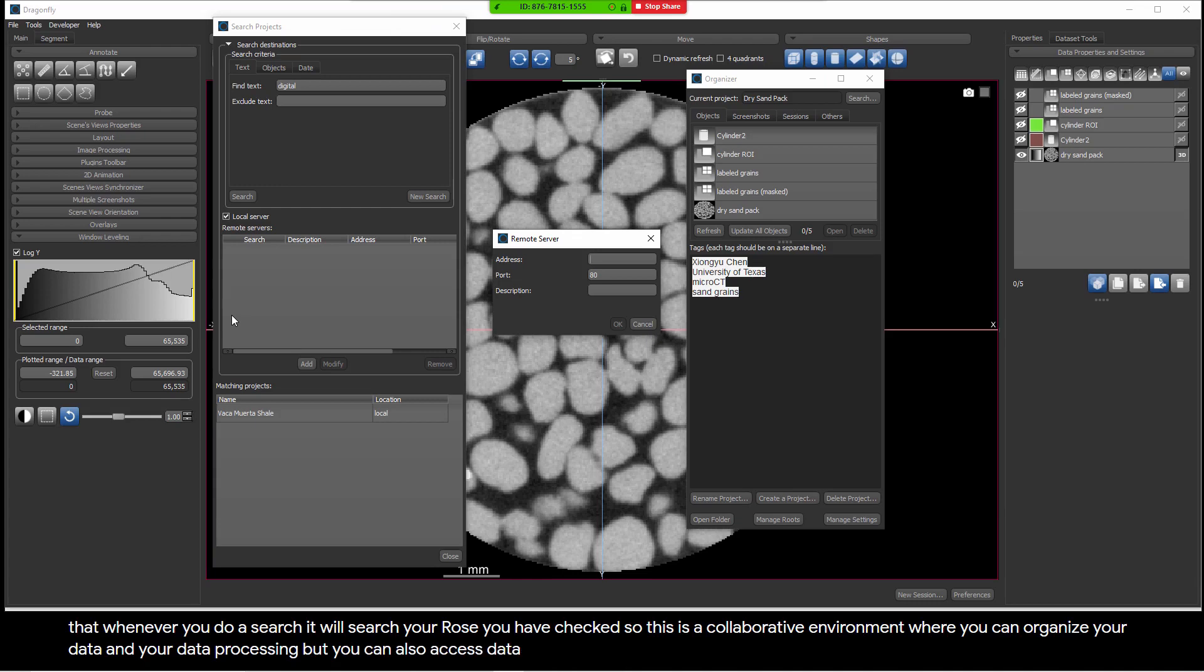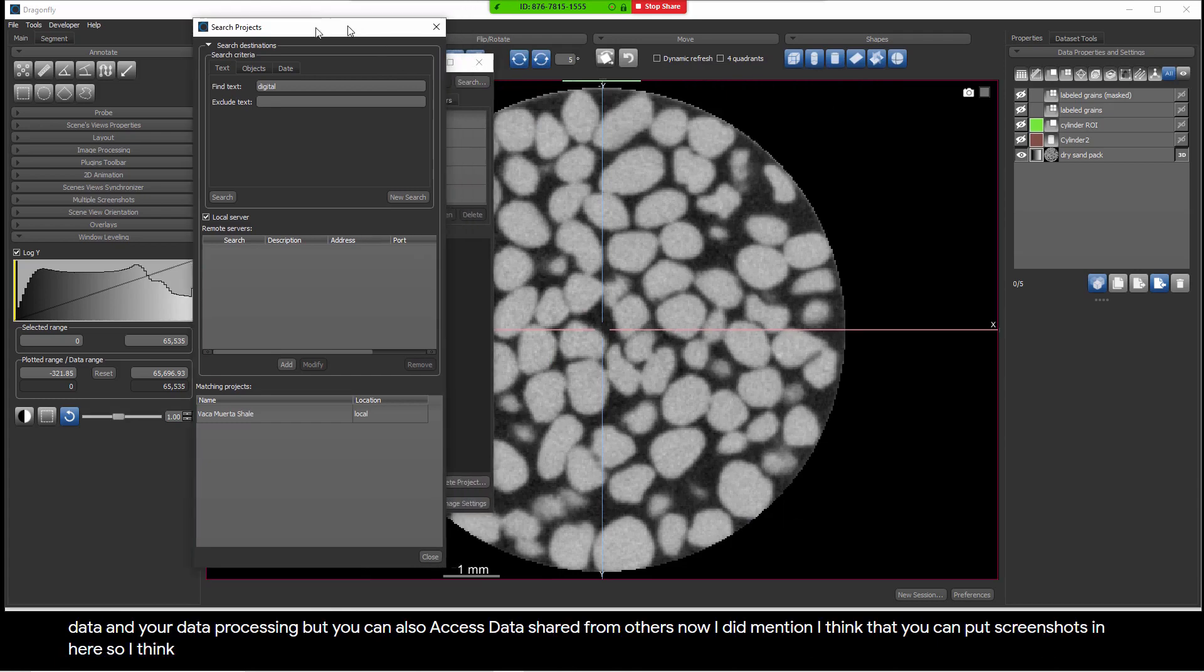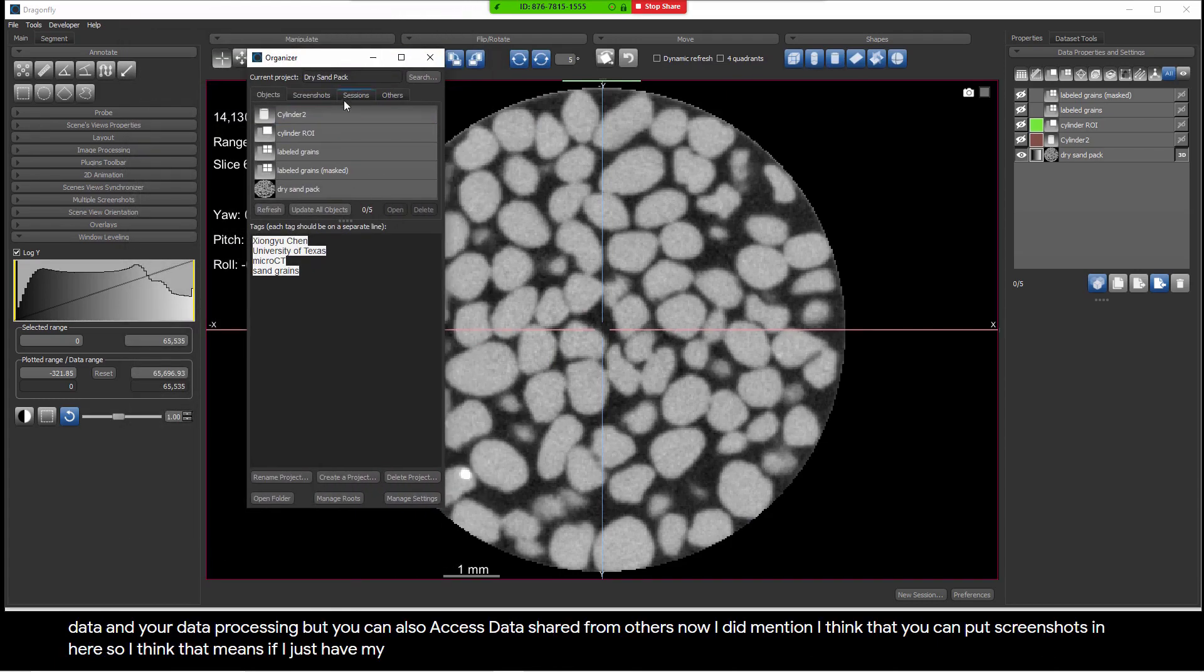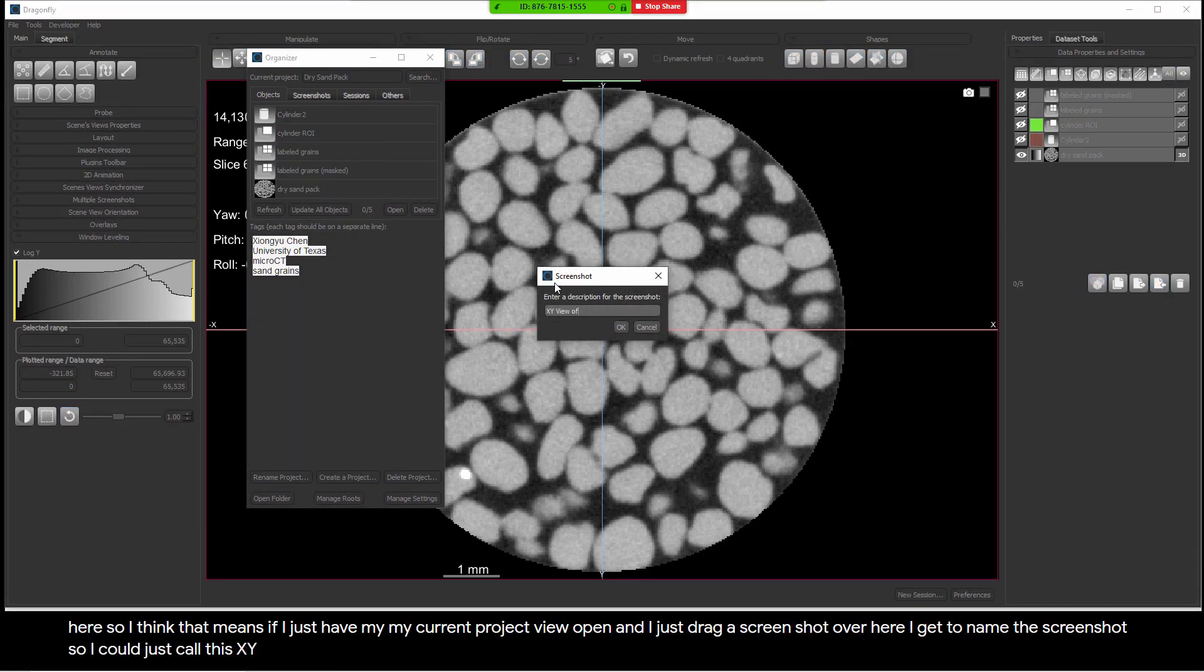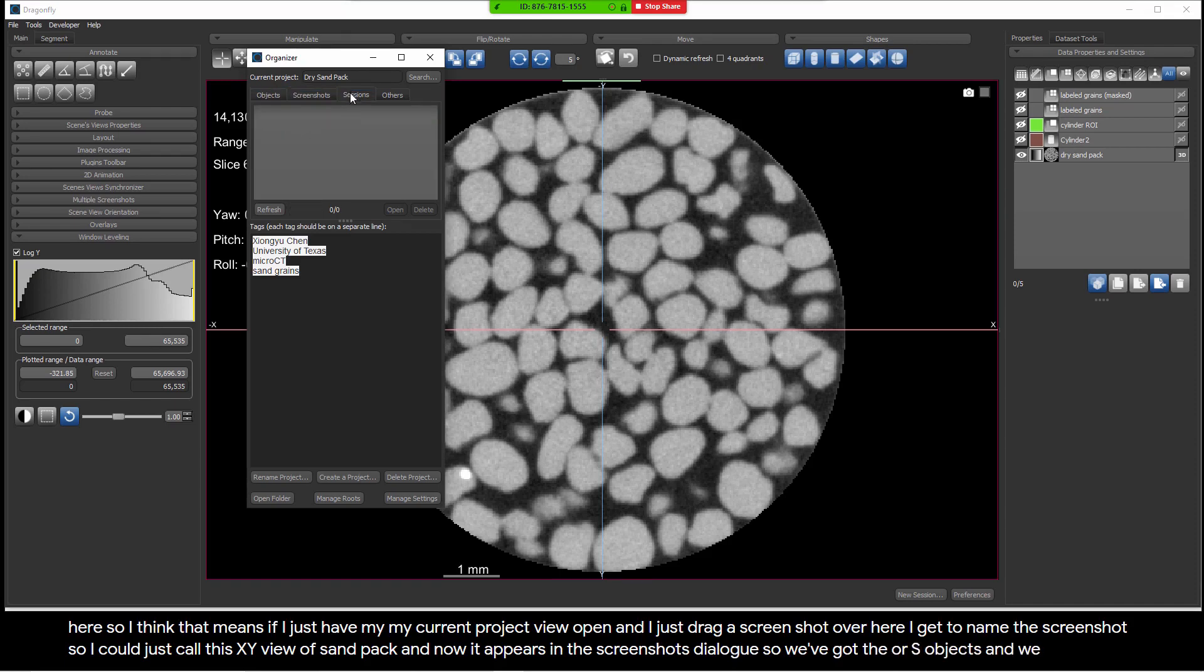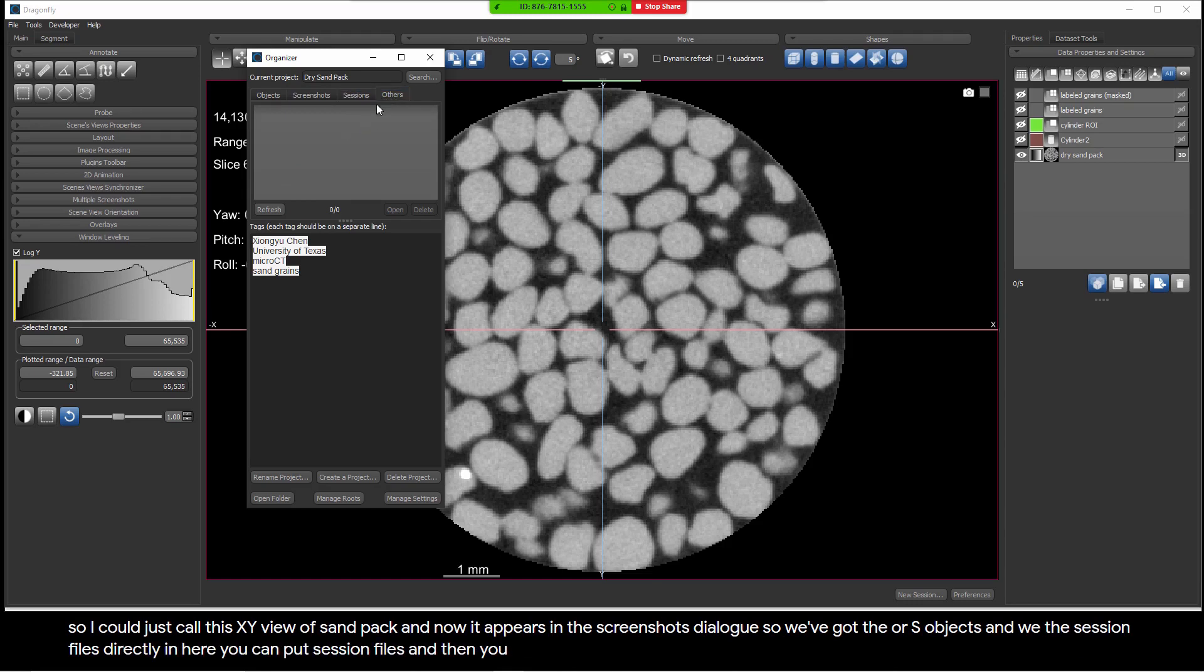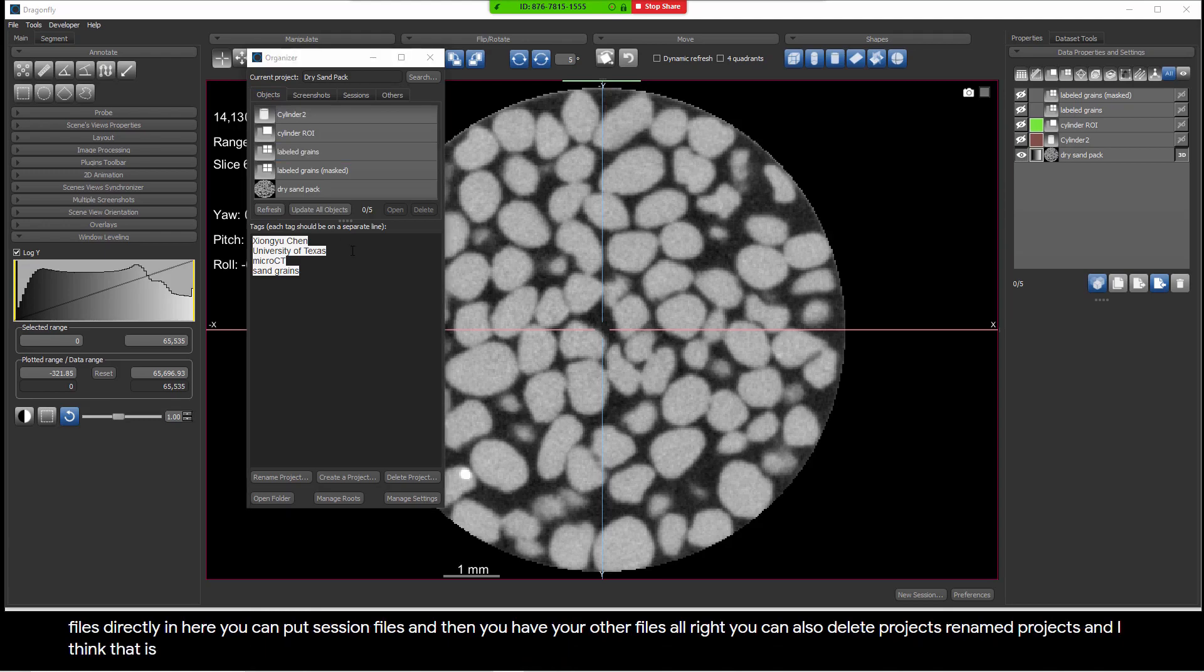I did mention, I think, that you can put screenshots in here. So I think that means if I just have my current project view open and I just drag a screenshot over here, I get to name the screenshot. So I could just call this XY View of Sandpack. And now it appears in the screenshots dialog. So we've got the ORS objects and we have the screenshots. If I want to save any session files directly in here, you can put session files and then you have your other files. You can also delete projects, rename projects. And I think that is about it.